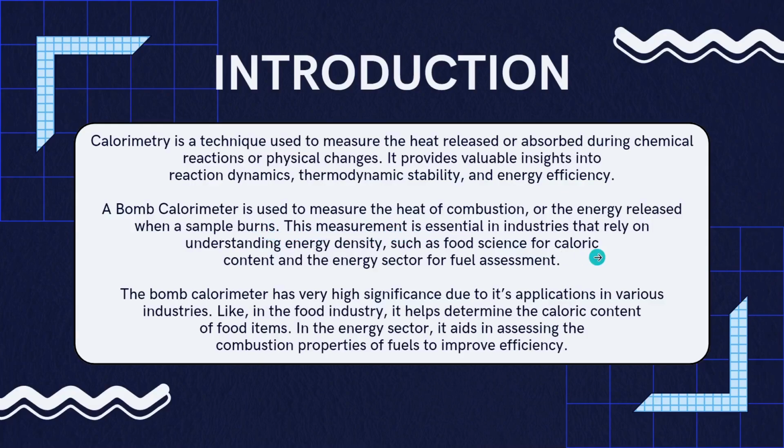This measurement is essential in industries that rely on understanding energy density, such as food science for caloric content, also in nutrition and diet, and the energy sector for fuel assessment. The bomb calorimeter has very high significance due to its application in various industries. Like in the food industry, it helps determine the caloric content of food items. In the energy sector, it aids in assessing the combustion properties of fuels to improve efficiency.